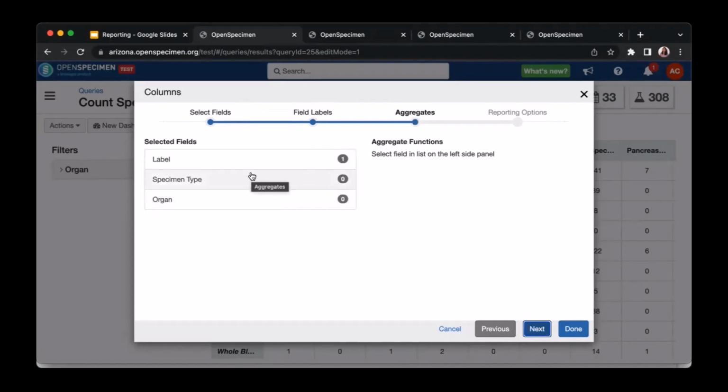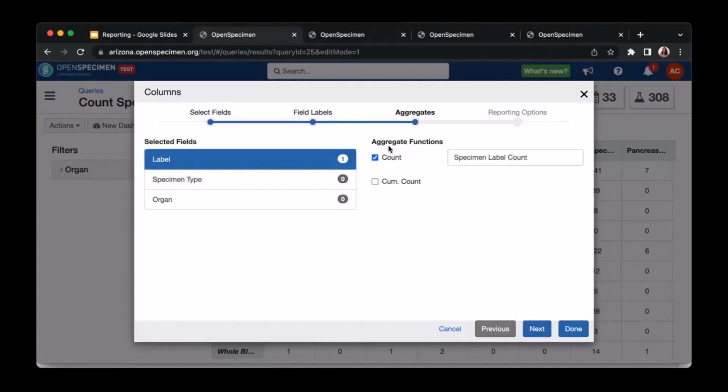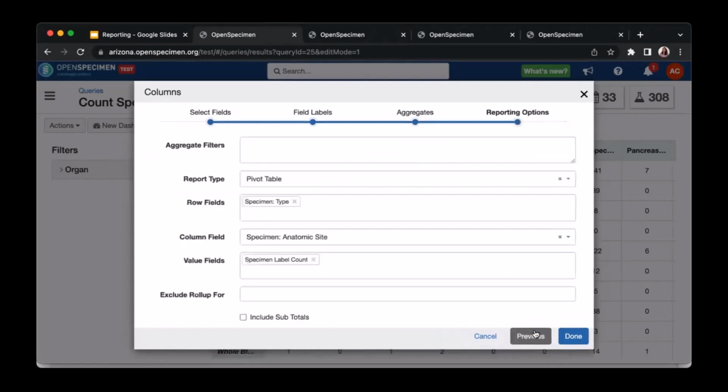So in your query, when you create a count-based query, there should be at least one field that is unique. Here, each specimen label present in the collection protocol is unique, so I have put count as for labels. You can also put it for PPID or visit label, which are generated uniquely by the system or you. Then there's barcode, etc. And now I'll say next.